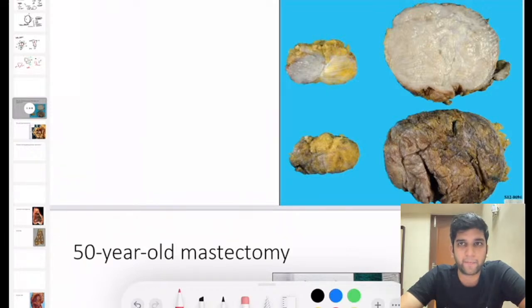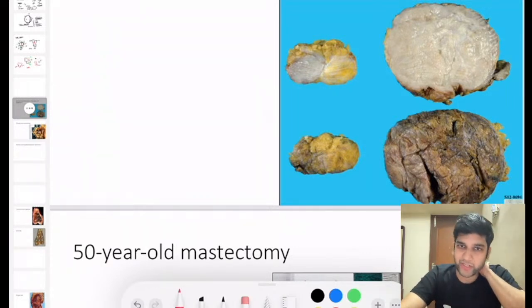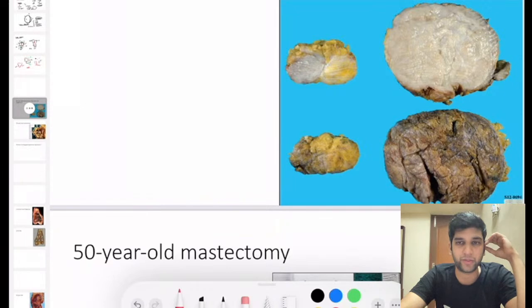This is from an article, so you do not have the correct diagnosis. I just want you to comment. If you comment and kind of go in the correct direction, that should be more than enough for me. So what do you think is the diagnosis? Can you comment? We can start with the specimen, then go to the diagnosis. Anyone?